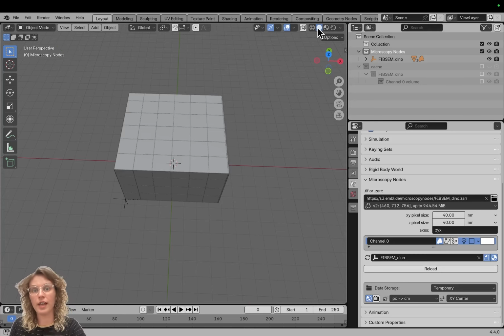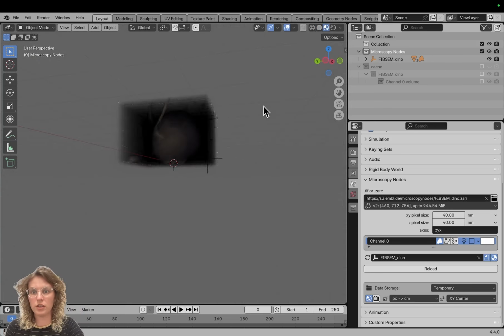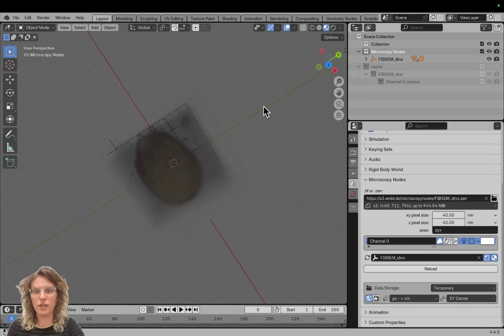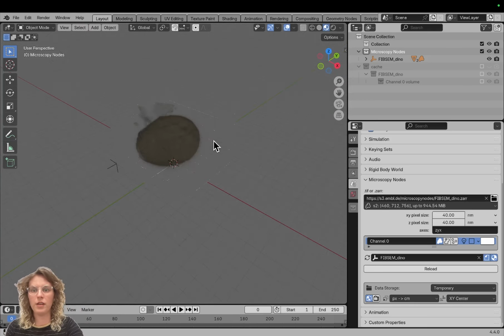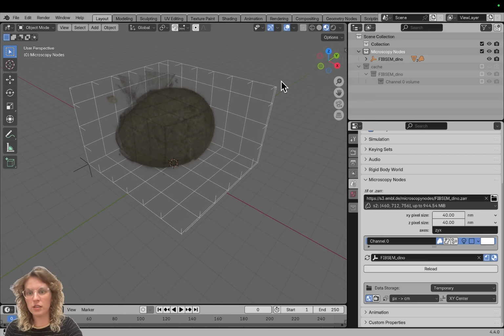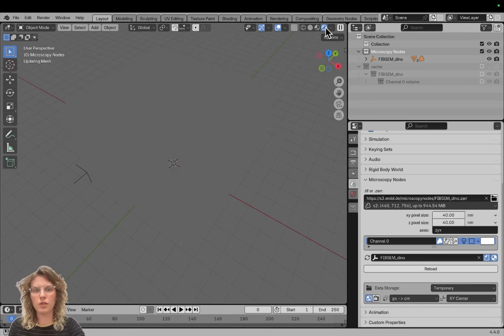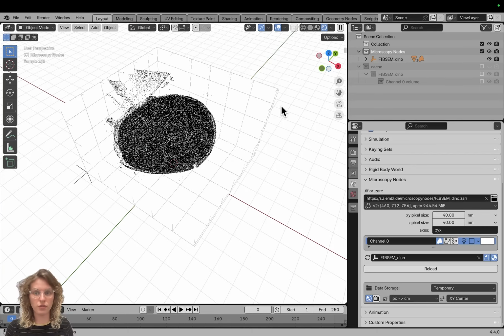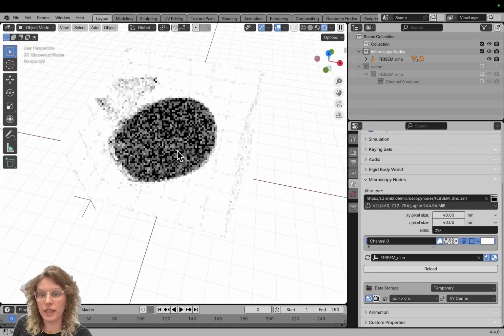And that's because we're in the wrong render mode. So here there's multiple render modes. There is a rasterized render mode, which looks like this. It is slightly faster once it gets going, but it doesn't give all the information, and it isn't as pretty, especially for the density rendering. So we usually go to this one where we see the ray traced version. And then here we have our data set.